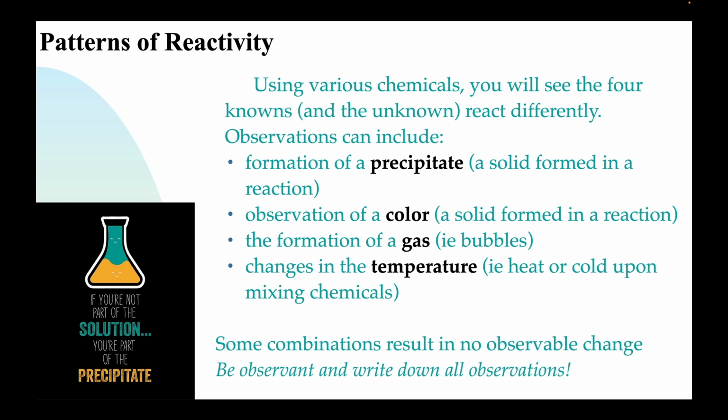Now, a lot of combinations, though, won't have any reactivity at all. They'll just sit there, and that's very normal, all right? So in this lab, it's going to help you to really be observant for chemical reactions, and also just remind you, write everything down, all right? If there's anything that you think might be useful, you should write it down on paper, and you never know when it might be useful.